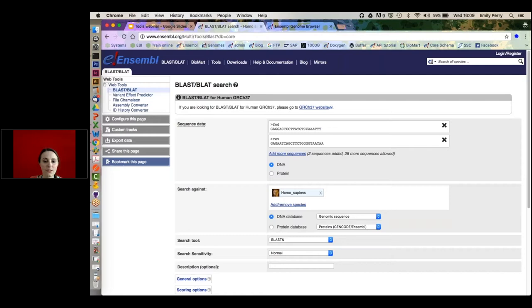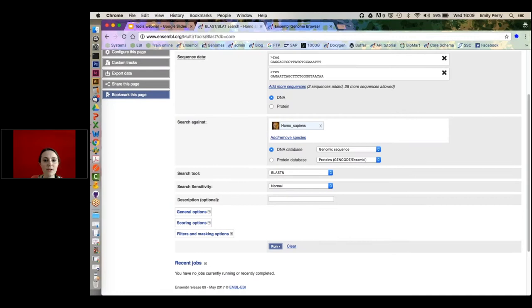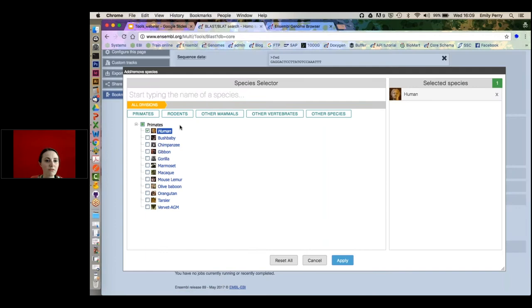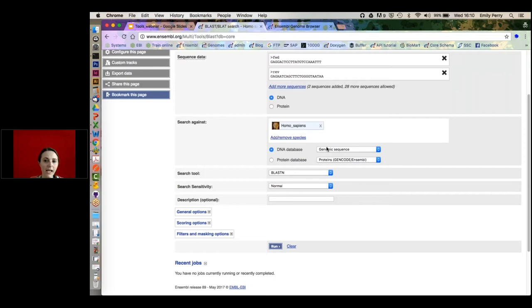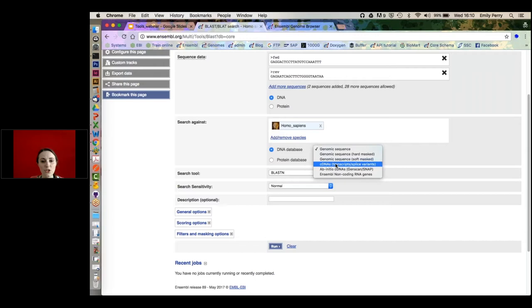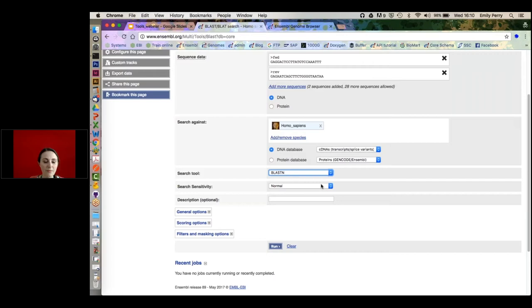It's separated the two sequences and detected that it's DNA. I'm going to search against a DNA database. I can change the species by going to 'Add/Remove Species', which is organized by taxonomy. I'll stick with human and choose the cDNA database instead of genomic sequence, since these are my RT-PCR primers. It's picked BLASTN for me as my search tool, and I'm going to choose a search sensitivity of 'Short Sequences'.